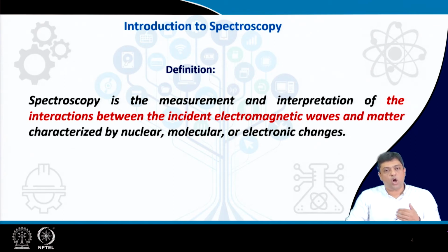One of the most common techniques used to determine this band gap is UV visible spectroscopy. So, this technique becomes extremely useful for our course, and if you go to the laboratory, you will find that this is a very simple technique, but it can give you a lot of information.